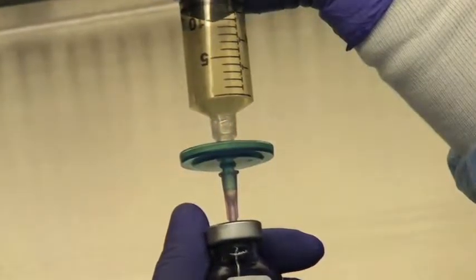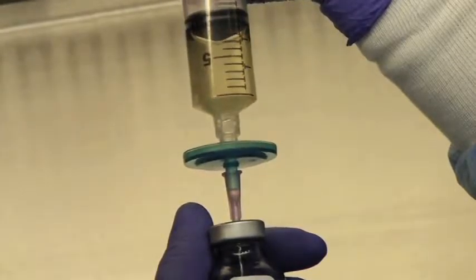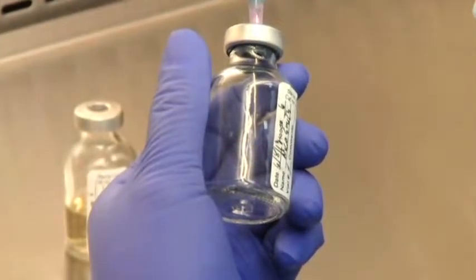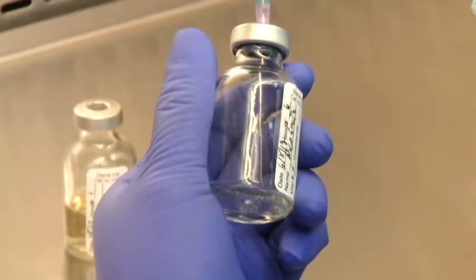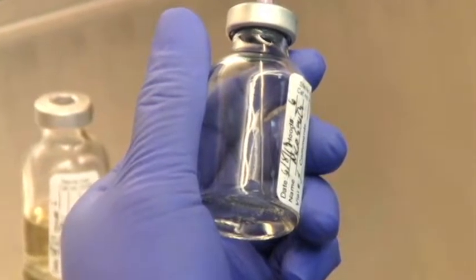This procedure monitors aseptic technique and includes filtering a non-sterile solution through a micropore filter. Controls are included in the test procedure. Bacterial growth is expected in the control vials because the solution dispensed into the vials is not sterile and has not been filtered.